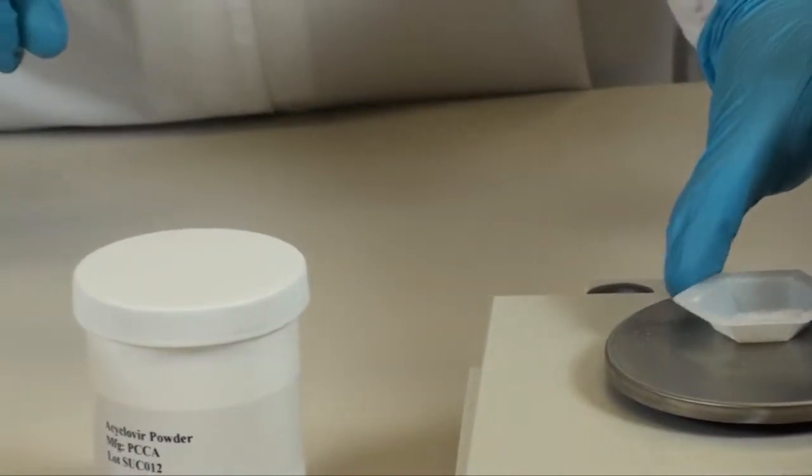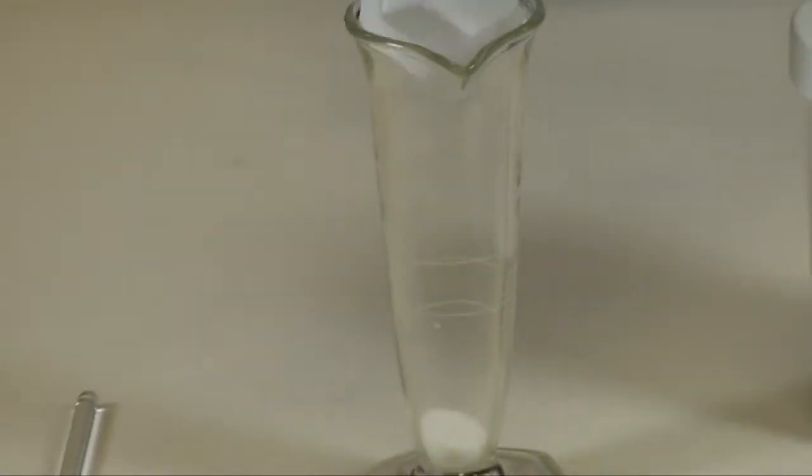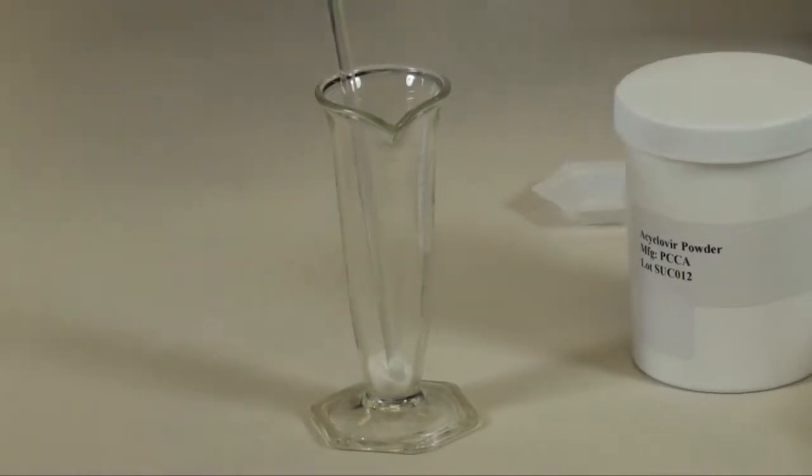Place the acyclovir powder into your one ounce graduated conical and place the glass stirring rod into the conical.